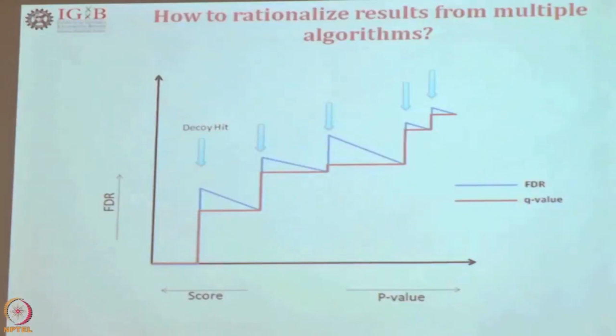and this was fairly okay with us because still the FDR is the same for this peptide as well as this peptide, for this score as well as this score, the FDR is the same. But the best was when we joined these points through linear regression lines, and now we have a curve which is going upward. As the score goes down, the FDR goes upwards.